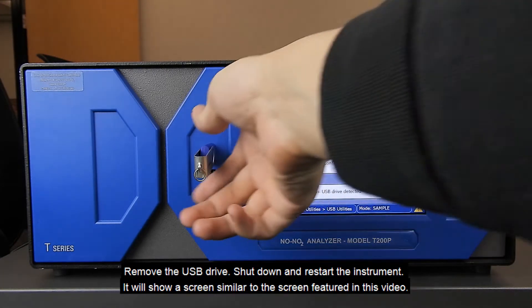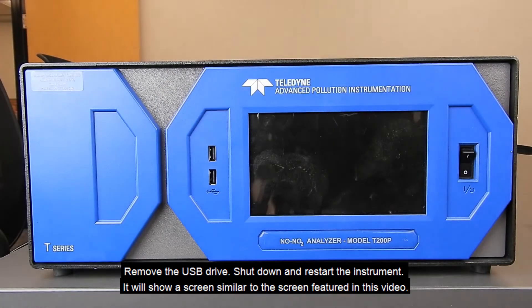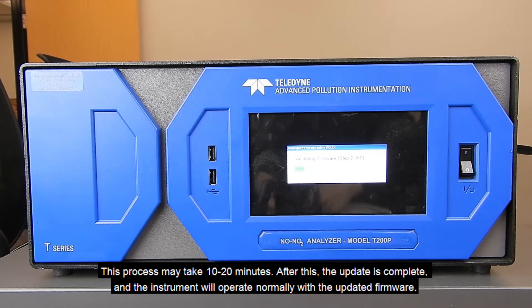Remove the USB drive and shut down and restart the instrument. It will show a screen similar to the screen featured in this video. This process may take 10 to 20 minutes. After this, the update is complete and the instrument will operate normally with the updated firmware.